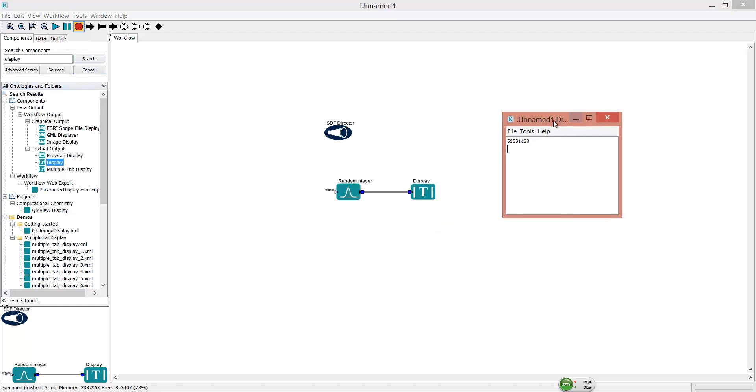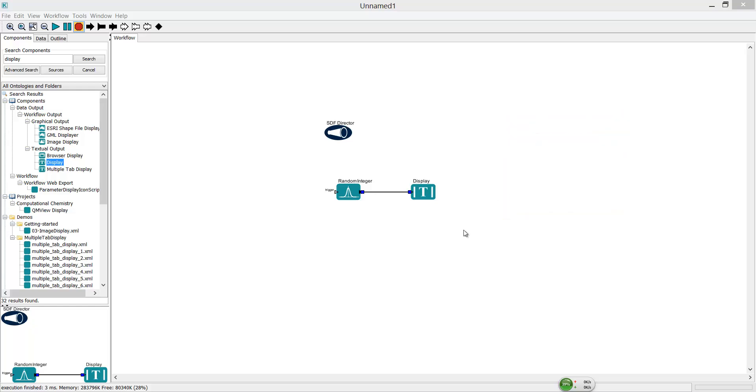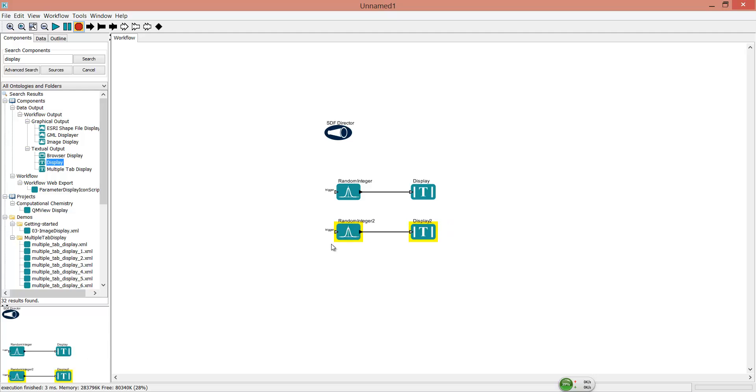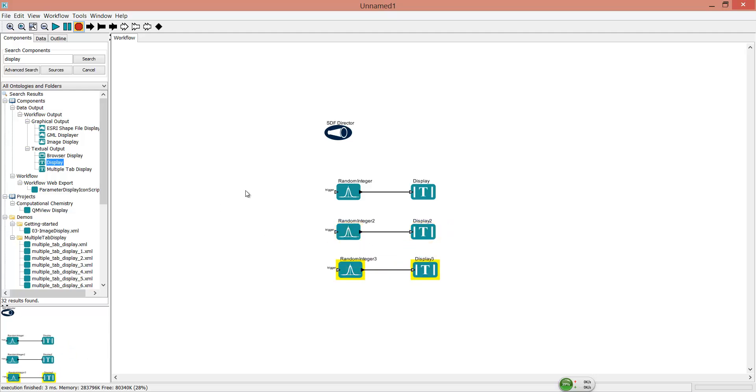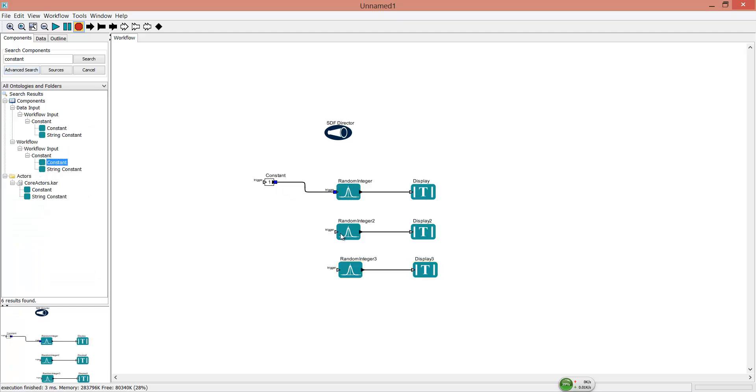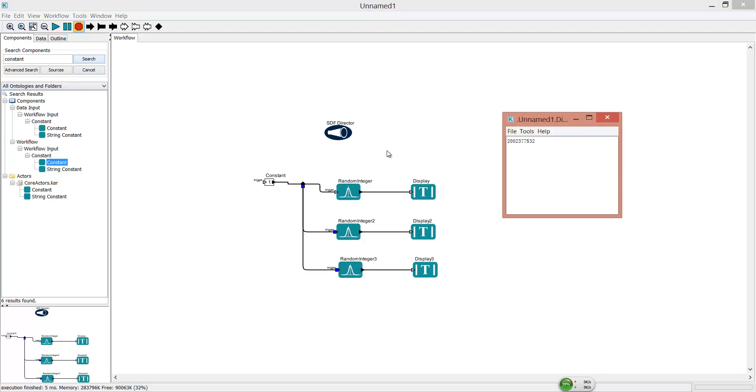Now you get a random integer. Since Kepler supports parallel processing, you can generate multiple integers simultaneously. Assign them to the same trigger. You get multiple integers.